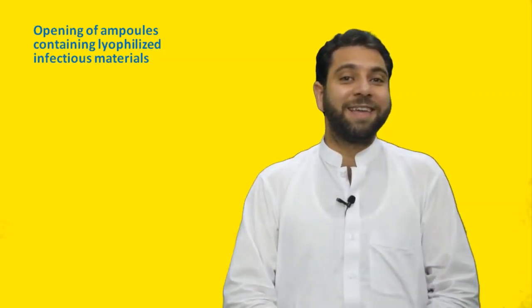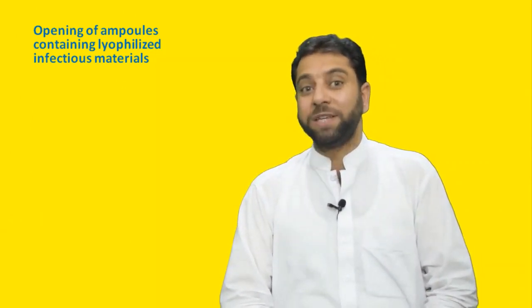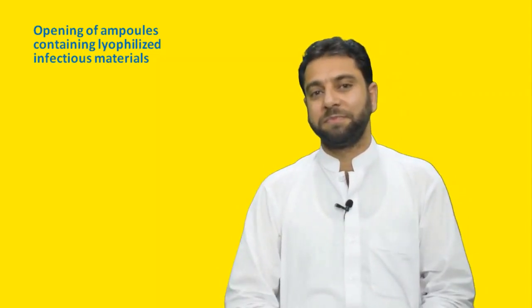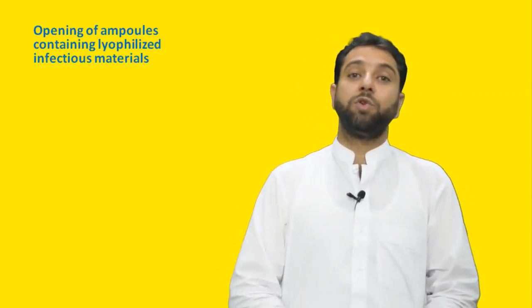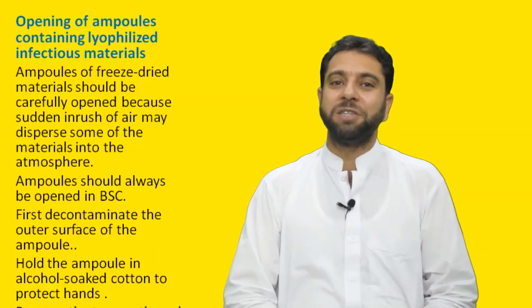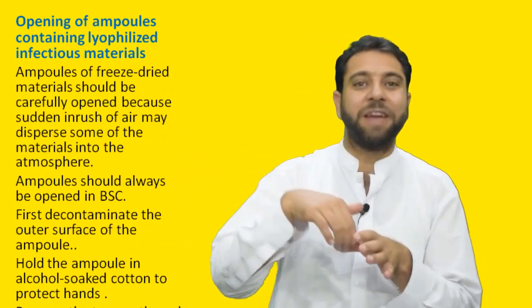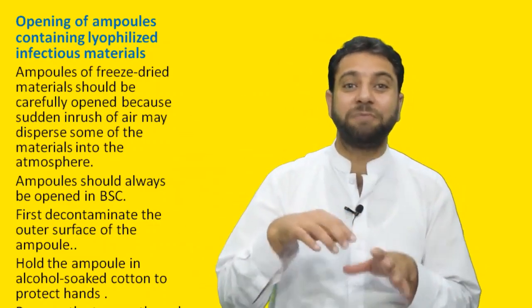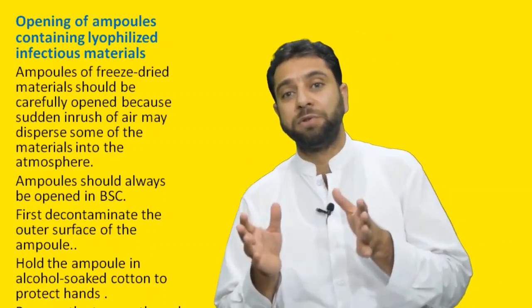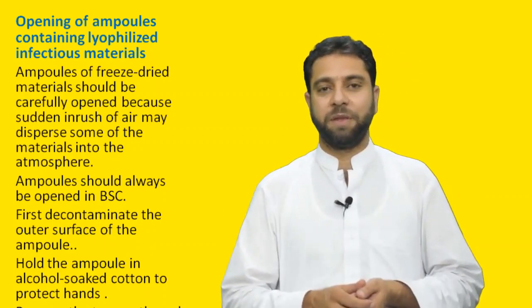Freeze drying is known as lyophilization, which is a low temperature dehydration process. Now, those ampoules which contain lyophilized infectious materials should be carefully opened because sudden inrush of air may disperse some of the materials into the atmosphere. Therefore, such ampoules should always be opened in biological safety cabinet.